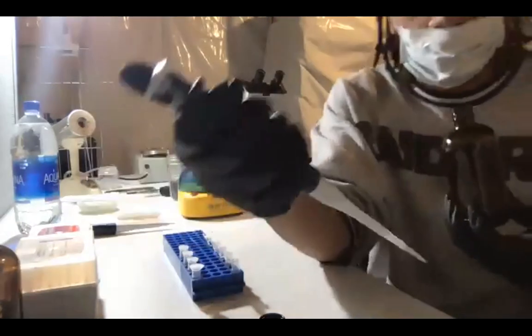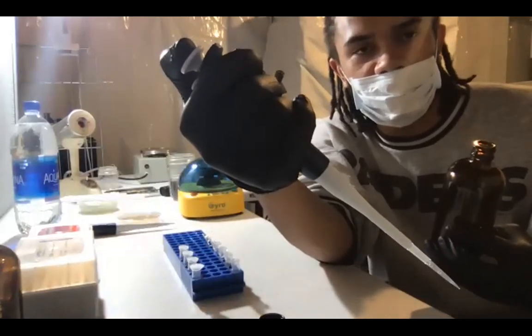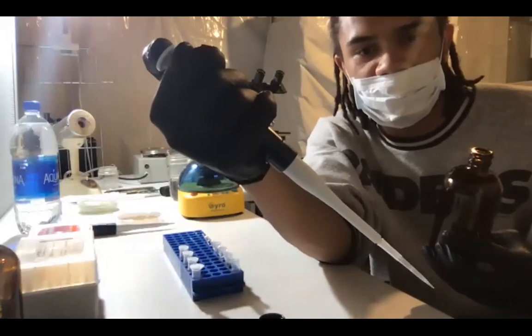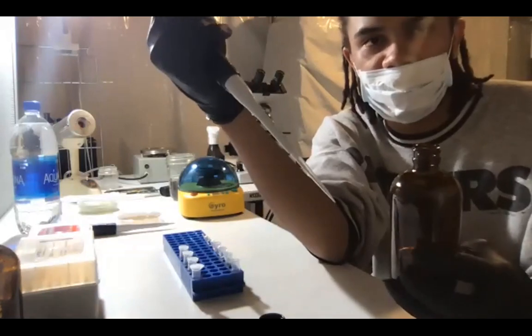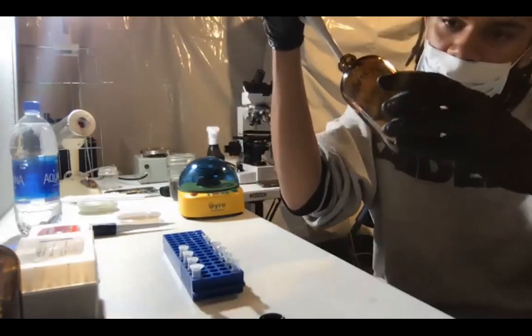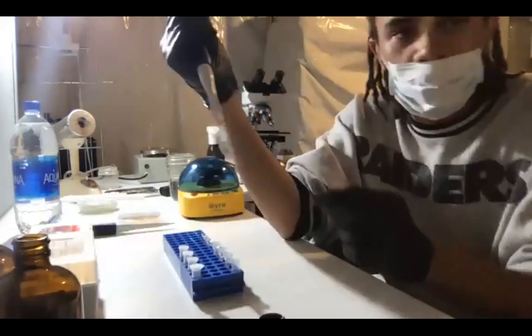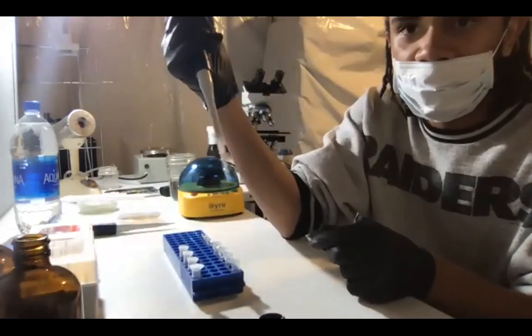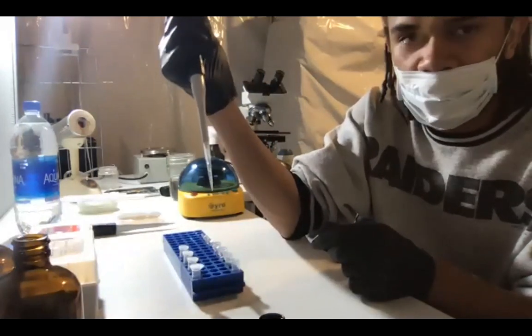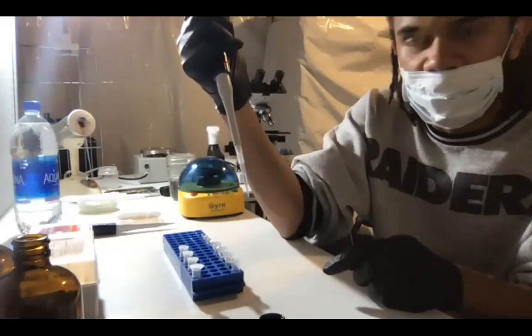And with the pipette, there's two levels to how hard you can push it down. You can push it down a little bit and you'll feel it have some pressure, and that's the first stop. And if you push it further, that's the second stop. When you're pulling liquid up into this to put into something else, go to the first stop to draw up the liquid. Then slowly release. If you stick this into some liquid and you just let go of the little plunger part on here without slowly releasing, it'll shoot liquid up into the pipette. So you have to release it very, very slowly.